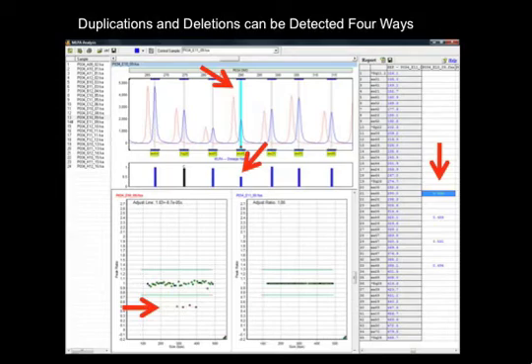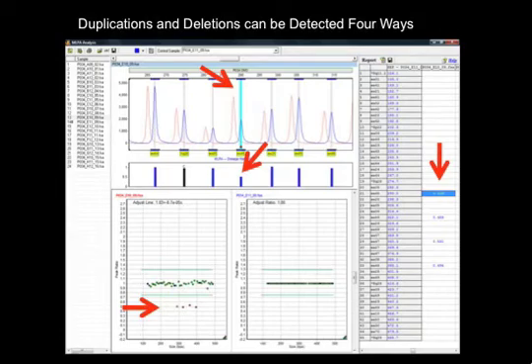All frames in the MLPA analysis window are interlinked. For example, clicking on a cell in the report table will highlight the sample in the sample list, the peak in the overlay trace, and the plot point in the ratio plot. Clicking on the data point in the ratio plot will zoom in on that area of the electropherogram, as it has here with Exon 45.